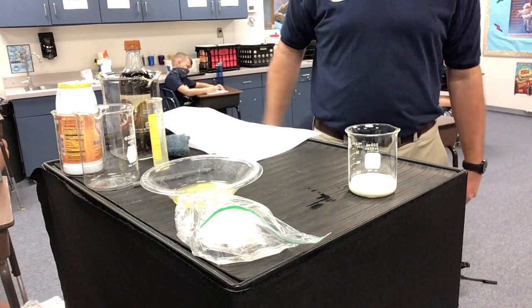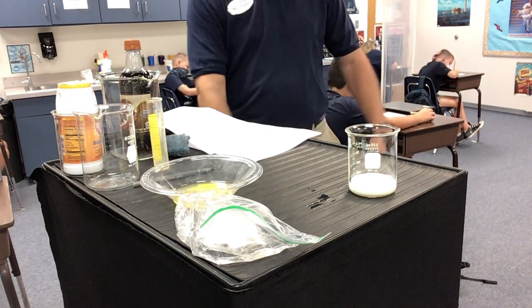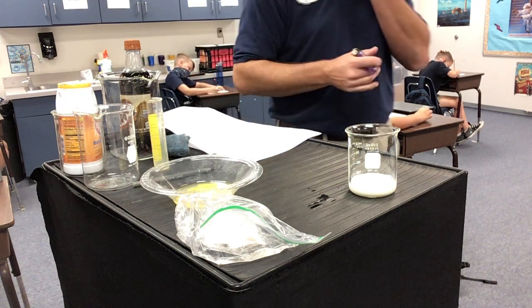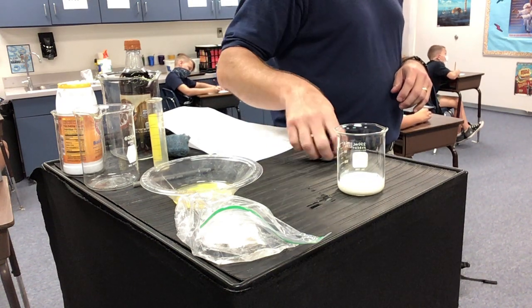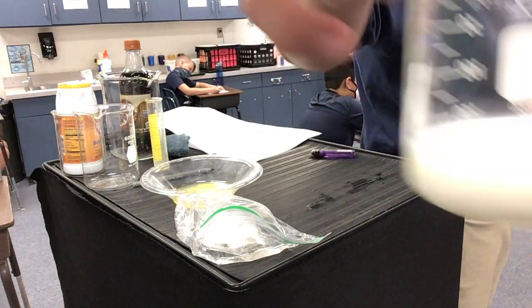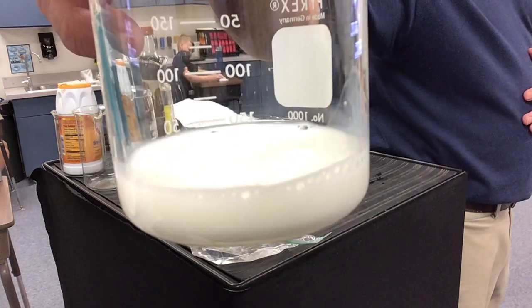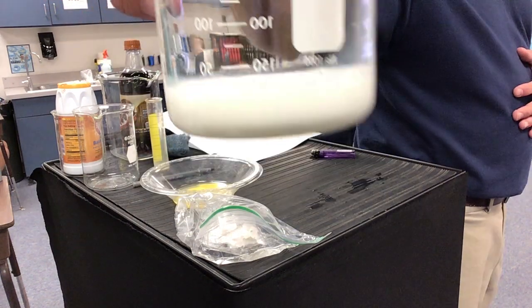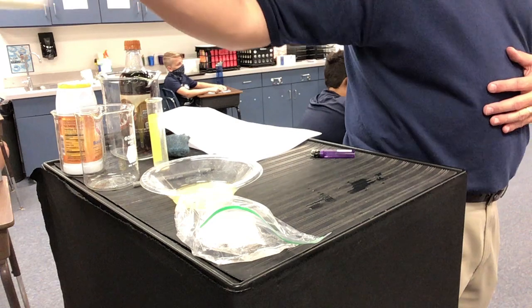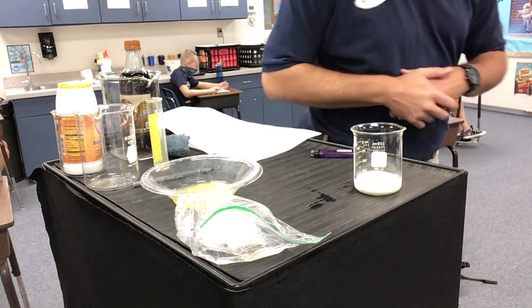But the question now is, did it change color by moving it from one container to the other? Did it change? Does it make bubbles? You see a bunch of bubbles being produced. I know there's a couple bubbles on there because I poured it in there. But are there bubbles being made? Is it still bubbling? No.